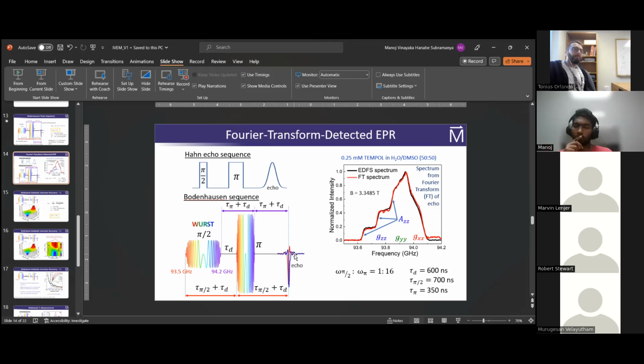Might I ask what was the ratio you were using for the pulse, or the pulse length? I'm not sure if that would make a difference, but in fact we had to try many iterations of pulse length and different ratios between the first and the second pulse. So maybe that is something worth considering.